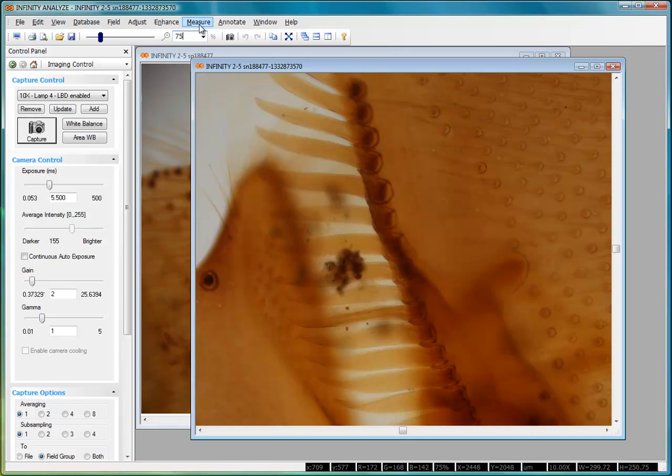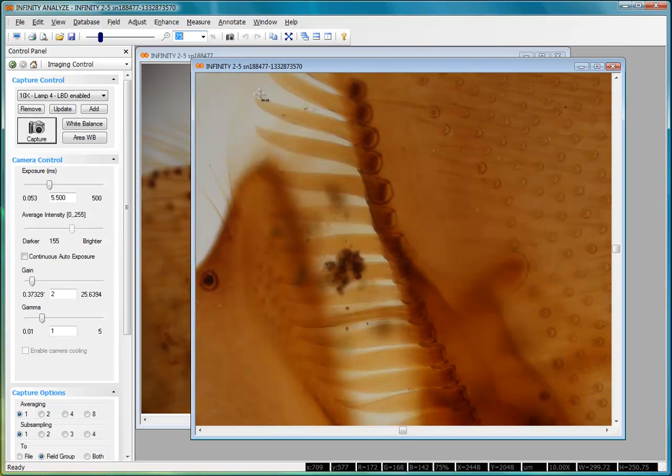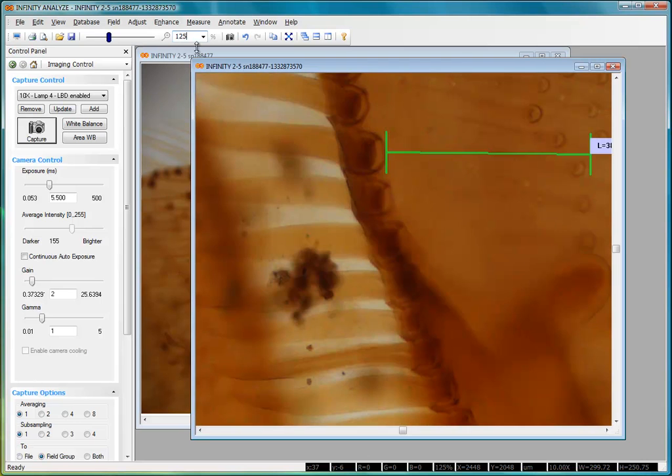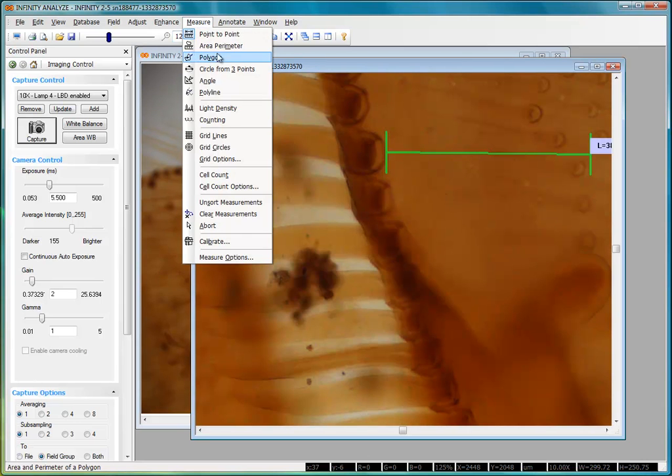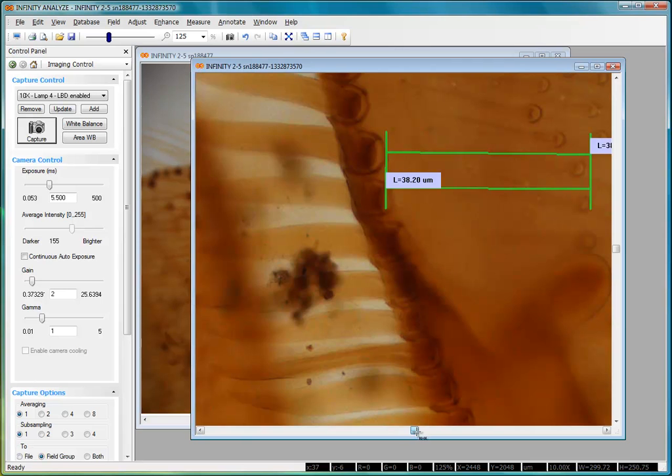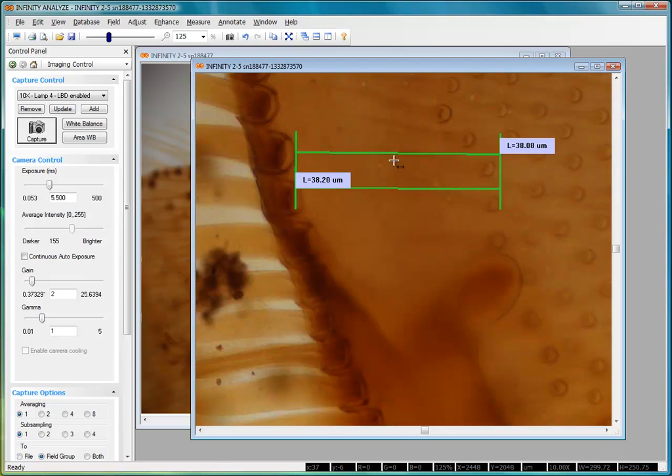If you take measurements on your image, assuming that you have a calibrated image, here I've got a length of about 38 microns. And if I change the zoom level and take another measurement and go in the opposite direction, you can see that the calibration and measurements honor the zoom level that you're at. So you can take your measurements at whatever zoom level you're comfortable with.